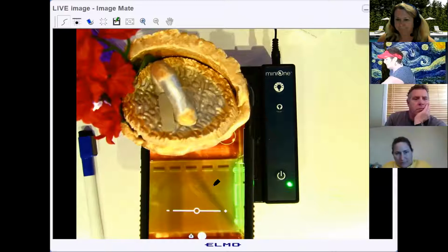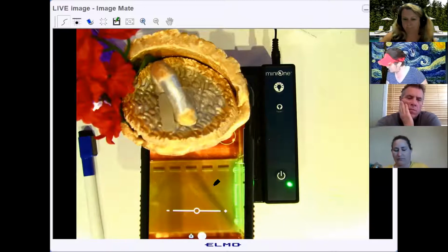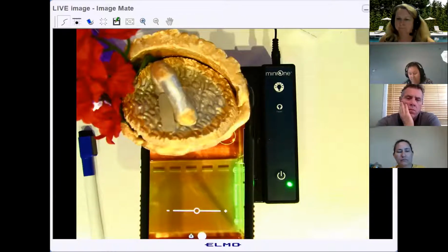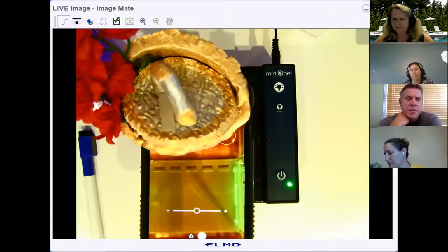I would say if you have the gel boxes that are kind of translucent on the bottom, something that helps kids with loading is to take a piece of that colored lab tape and put it flat on the table and then line the wells up over top of that. It helps them see the wells a little bit better. Yeah, the black on black is kind of hard to see sometimes, isn't it? Anything else? Tor, I think you need to unmute yourself.